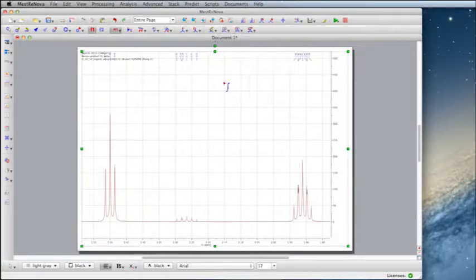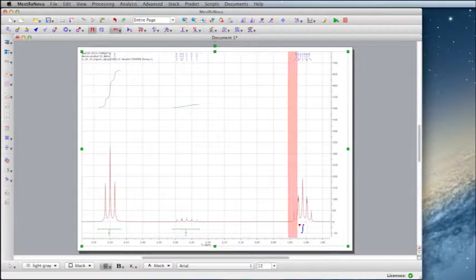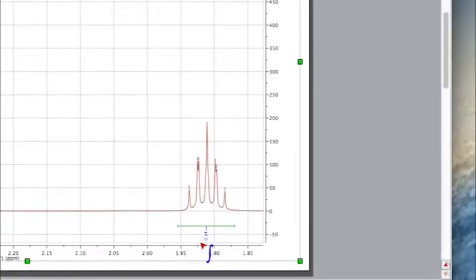Once you have selected the manual option, simply highlight the peak you wish to integrate. You will notice the integration value in blue along the green bar stretching across the base of the peak. You only want to be integrating the main prominent peaks in your spectrum for analysis. Integrations for peaks that belong to solvents are not necessary.